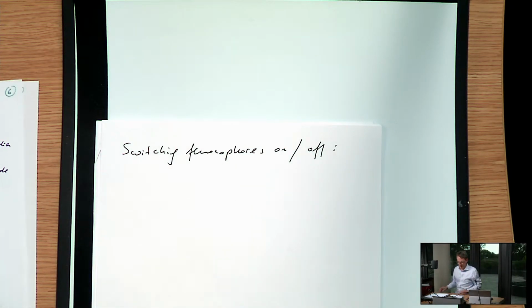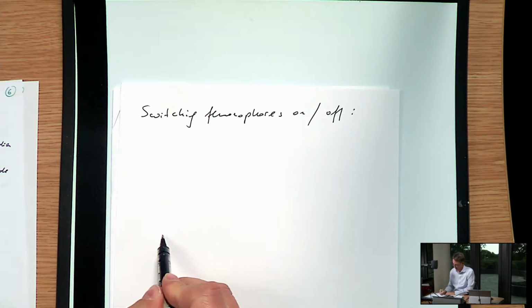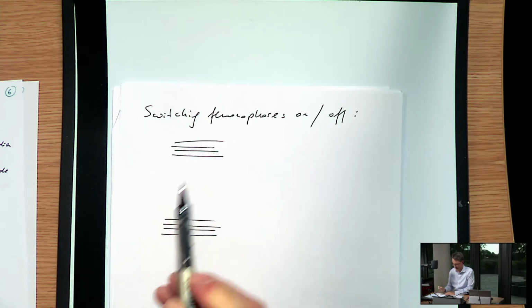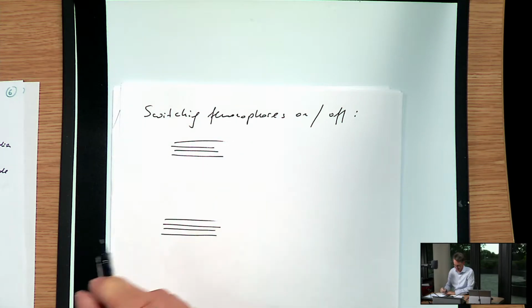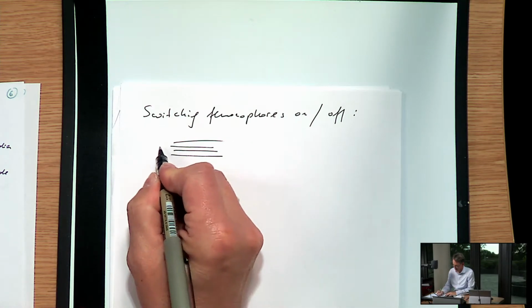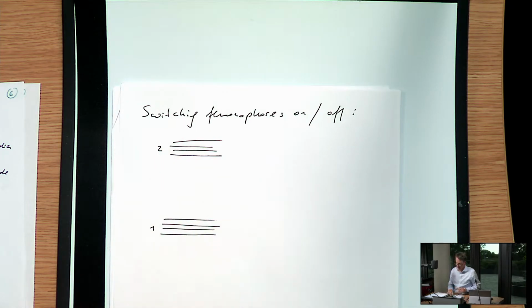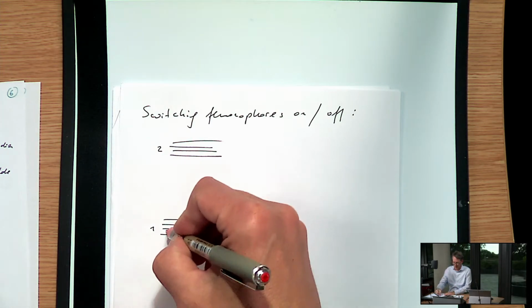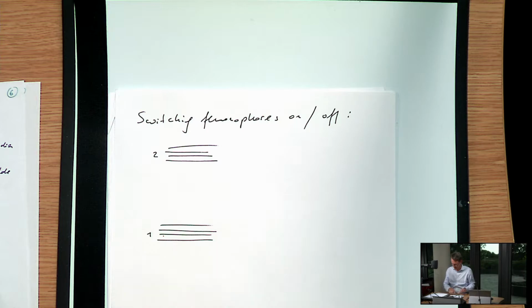So in the normal fluorophore, we have our usual lower state and the upper state, and so let's call that state 1 and state 2. And so what happens in a normal way, we've seen this when we went through the fluorescence rates. So we drive population up, and I'm just doing this now pictorially. So now before I do this, let me put something else in here.